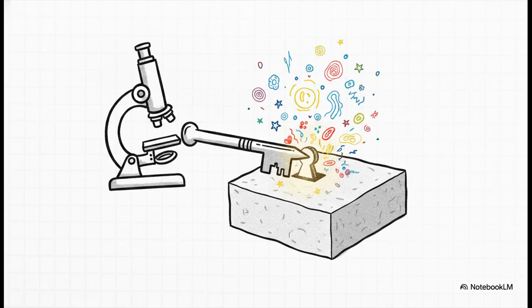So, whether we're relying on the basic, brilliant contrast of H&E or diving into the ultra-high-resolution depths of the electron microscope, choosing the correct chemical tool is the ultimate key in diagnostic histopathology. We aren't just passively looking at tissues. We are actively engineering them with chemistry to reveal their deepest secrets.